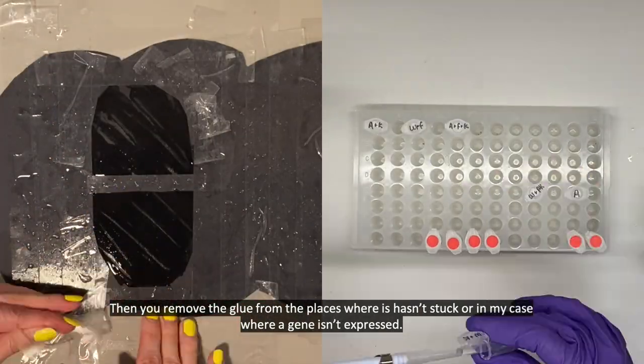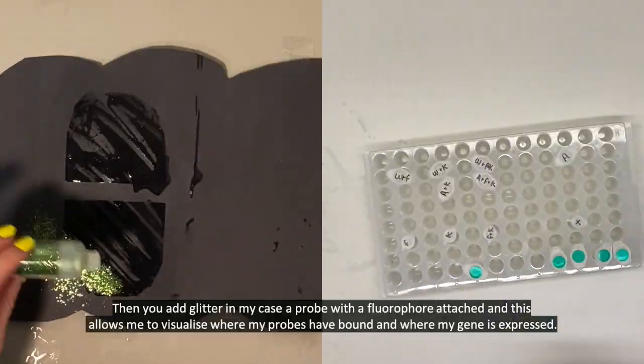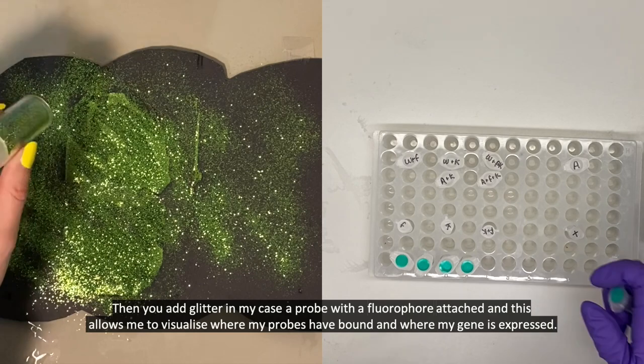Then you remove the glue from places where it hasn't stuck, or in my case where the gene isn't being expressed. Then you add glitter. In my case this is a probe with a fluorophore attached, and this allows me to visualise where my probes have bound and where my gene is expressed.